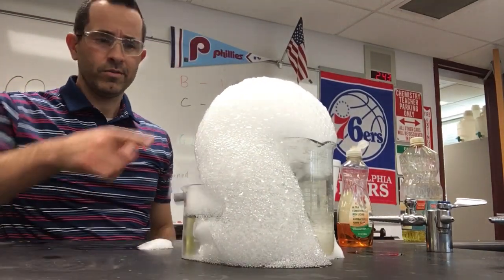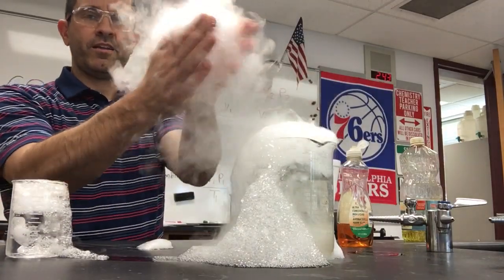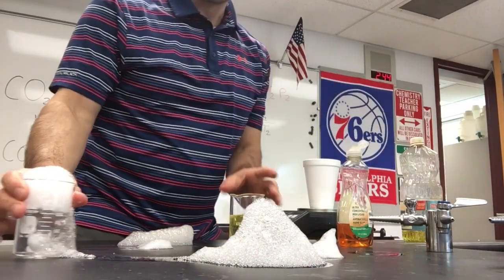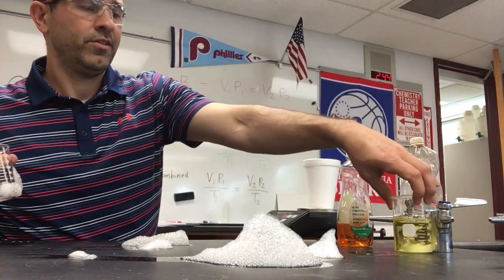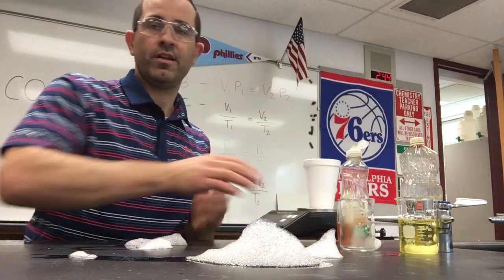All right, video two. Still have a mountain of bubbles right here. Let's take care of that. We'll send it to the sink and pour this into the sink. I don't want to pour the oil into the sink — that can clog drains — so I'll just wait a little bit and pour that back into the bottle and reuse it at some future date.